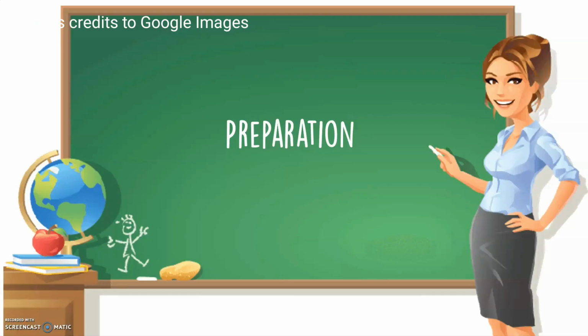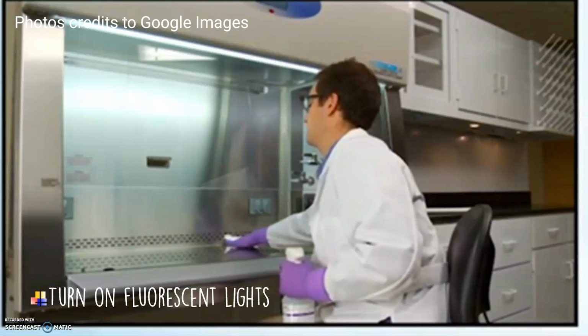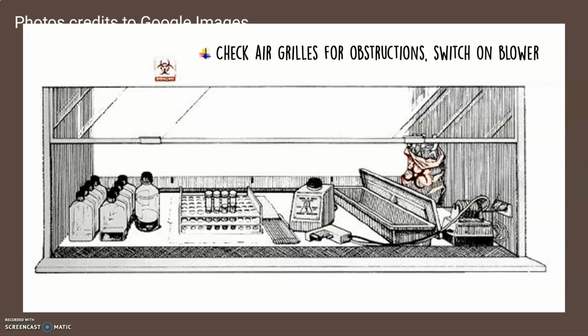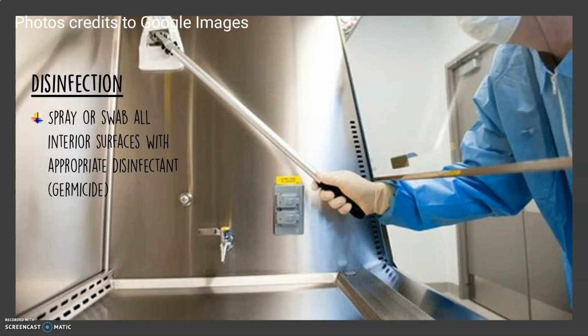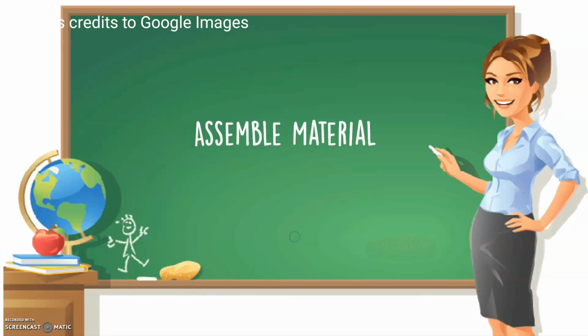So how do we prepare in using this biosafety level cabinet? Turn on the fluorescent lights. Check air grills for obstructions. Switch on the blower. Allow air to purge the workspace for 5 minutes. And of course, we have the disinfection. Spray or swab all the interior surfaces with appropriate disinfectant or germicide. So it's very important to clean all the necessary parts of these cabinets.